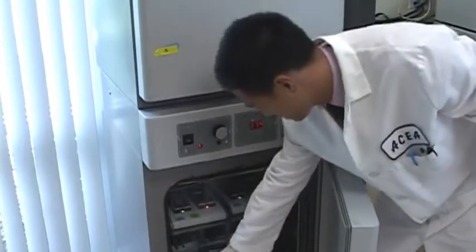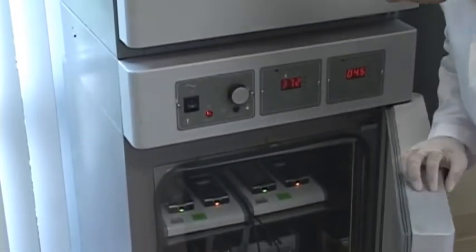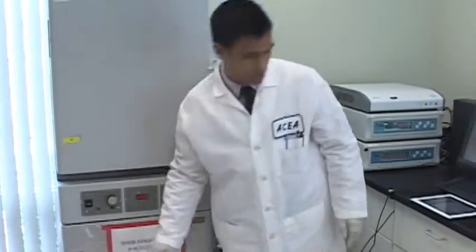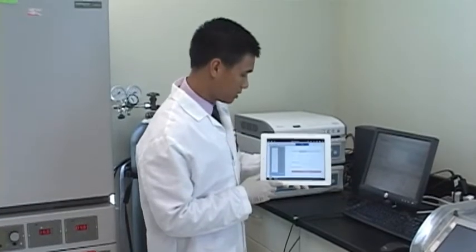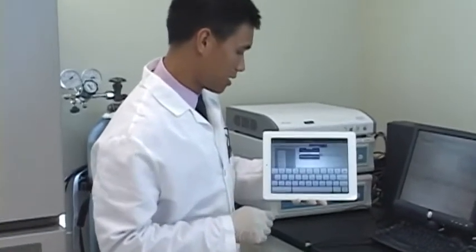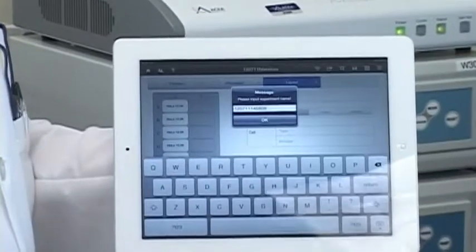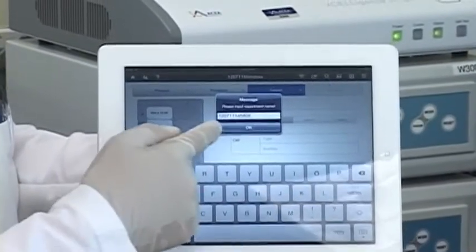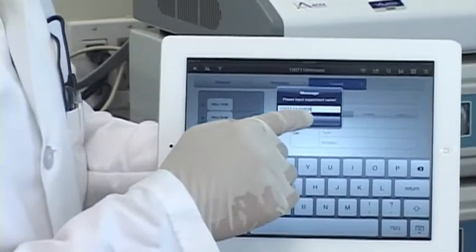The green light indicates that the plate is in fact engaged and the station is ready. And then we go back to our software and we just click the start button and you're immediately prompted to name your experiment. And in this case, you can use the default name, which corresponds to a date as well as a serial number that's automatically generated. So in our case, we can use the default.